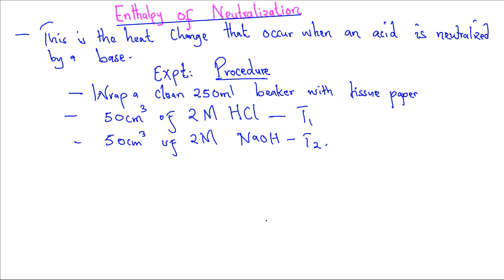Add the 50 cubic centimeters of 2 molar sodium hydroxide carefully. Stir the content in the beaker while adding. Note the final temperature as T4.